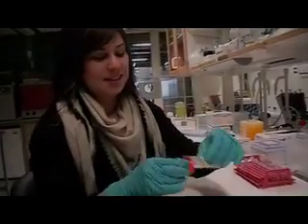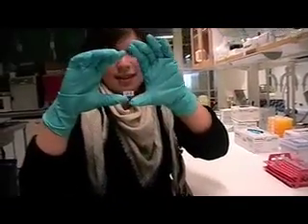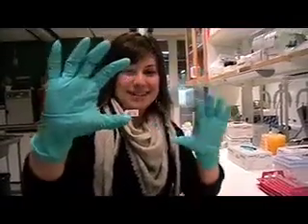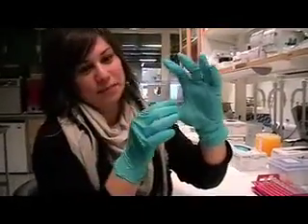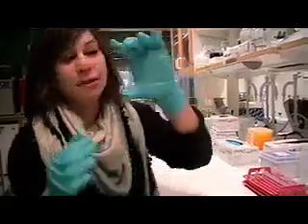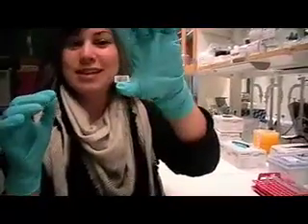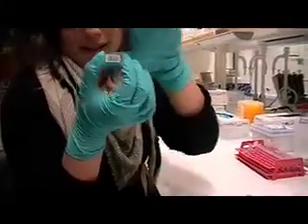So this is how a microarray looks like. It's just a microscopic glass slide, but of course you cannot see anything. But if you breathe on it, you would see 14 different blocks since we print it like that.